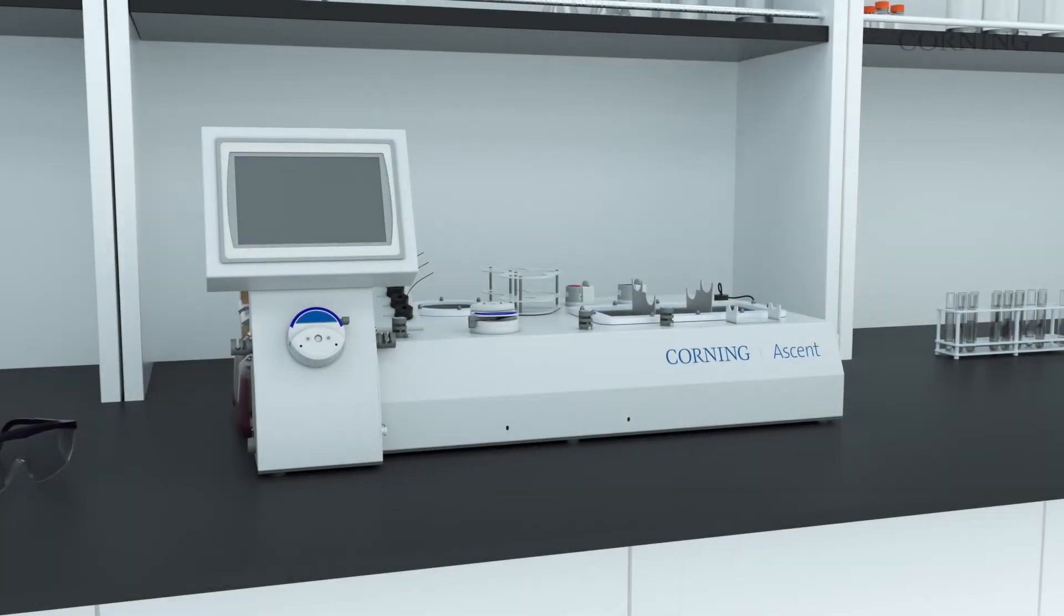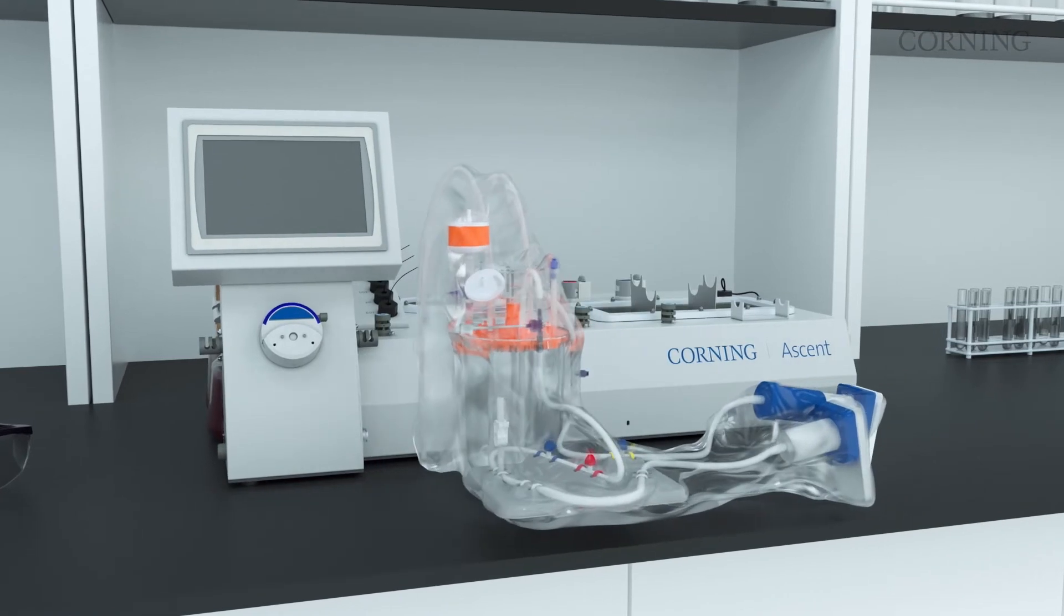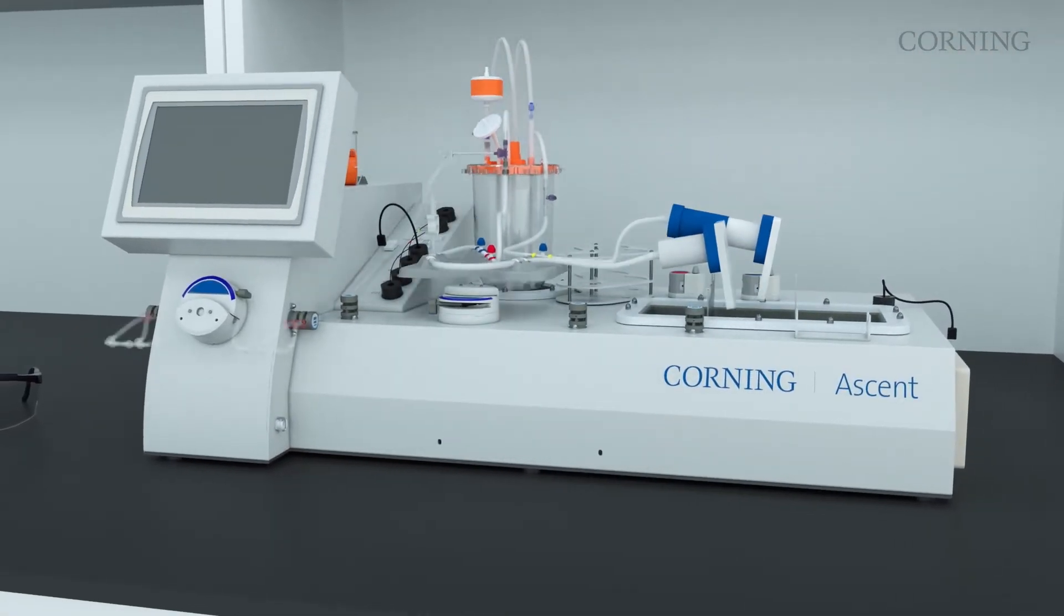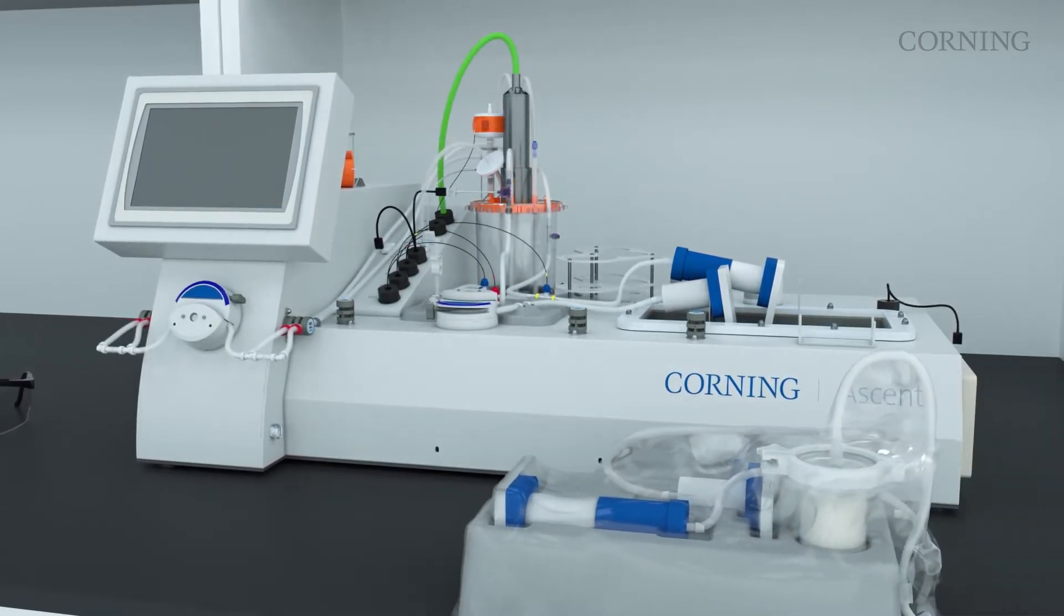The Ascent FBR system sets up quickly, consumables are irradiated, pre-assembled with closed system tubing and ready to use. No autoclaving is necessary.